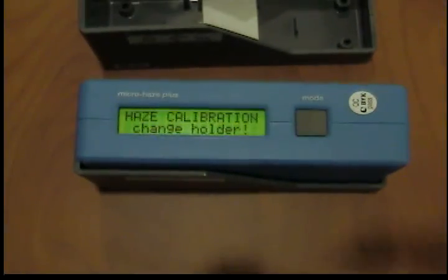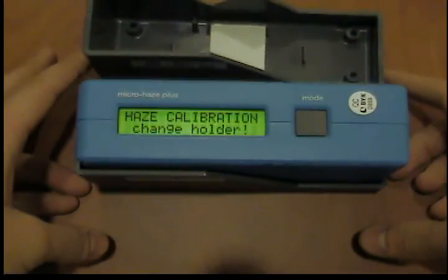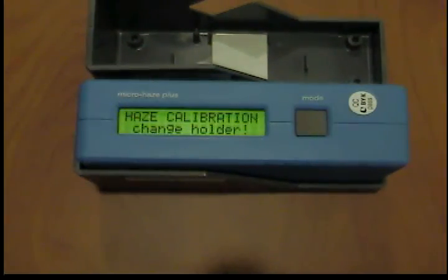Gloss calibration is completed after approximately three seconds, and haze calibration appears in the display. You can normally exit this right now, because haze calibration does not need to be completed every time you make a measurement, but for this case, we'll show you how to do both.